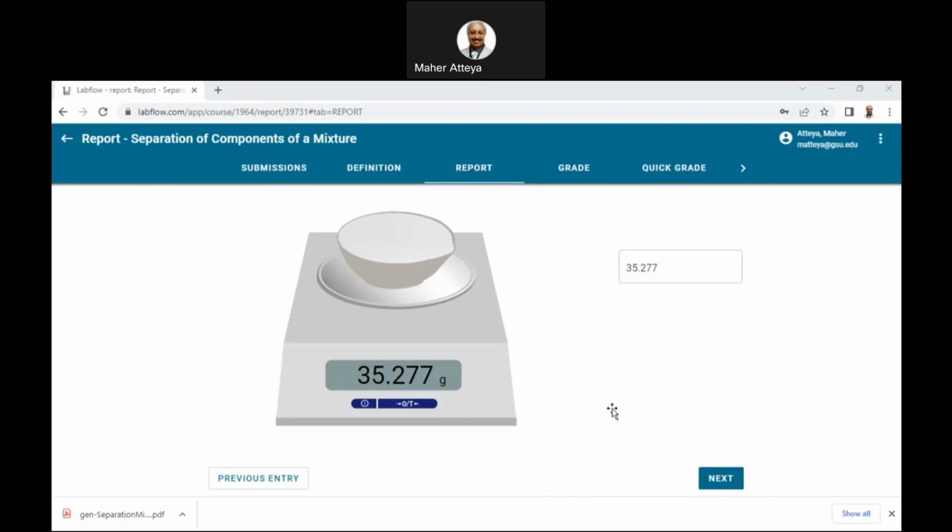We'll be using it to separate the sand from sodium chloride solids by adding tap water. So tap water is polar, will dissolve the ionic compound sodium chloride. The sand, not polar, will be untouched. And then we can decant the solution of sodium chloride and then evaporate each one separately.